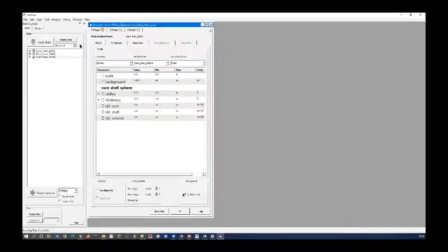And now I'm going to put my priors in. Fit page 5 is the core contrast. For the core contrast, my core in this case is D2O, so scattering length density 6.3. I only have hydrogenous surfactant, so that's got a scattering length density 0.62. And in this case, the bulk medium is hydrogenous cyclohexane at -0.28.